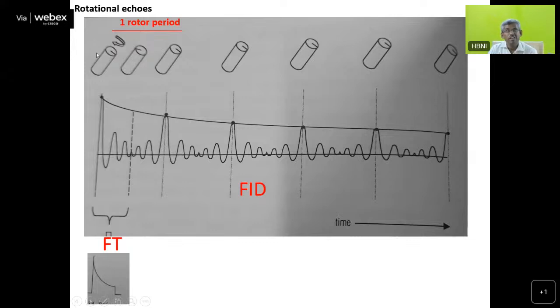So range of field is like a disturbance, correct? Because any spread in the magnetic field is like a disturbance only. So what happened? It will feel a range of field. And finally, it will come back to the original position like this one.